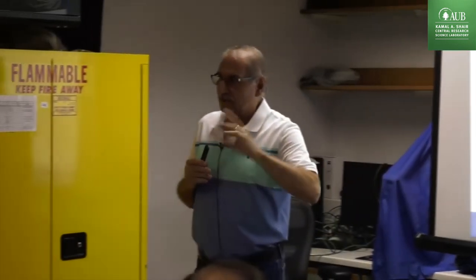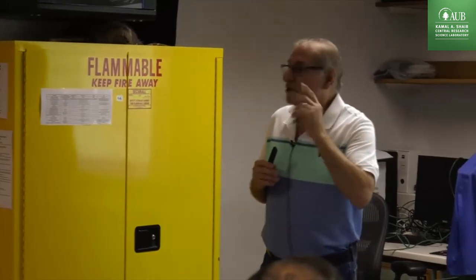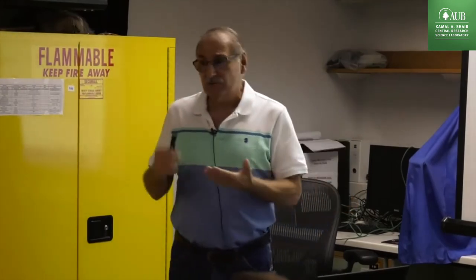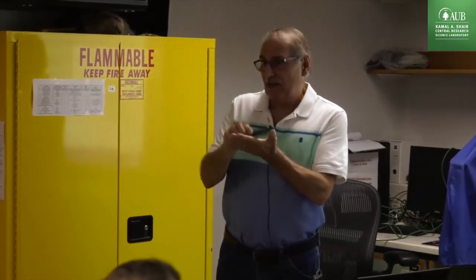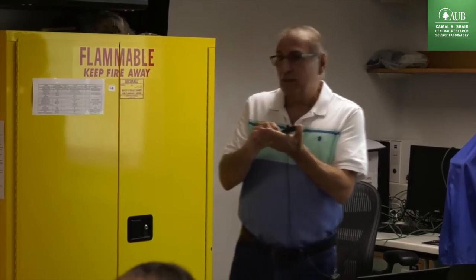TPO and TPR: you can oxidize and reduce. It can tell you how many cycles you can regenerate your catalyst. Sometimes poisoning or deactivation of your catalyst is due to the deposition of carbon. When molecules crack, you have carbon that covers the active species, and they are not accessible to the reaction anymore. So you have to remove the carbon.